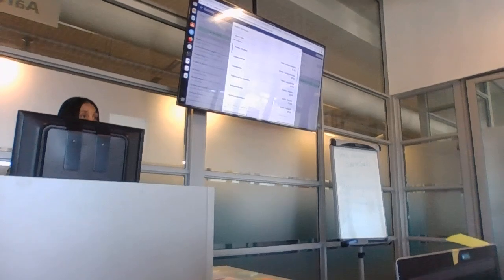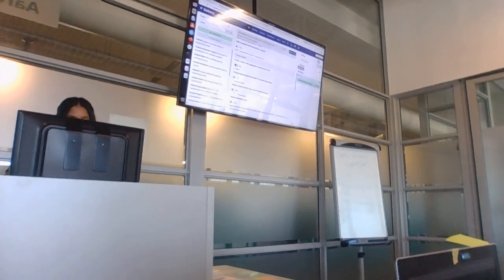Yes, we start. I think he has a question. Go back. Run and to check Kraken. Run to. But I'm not running. No. Okay, before that. Before.